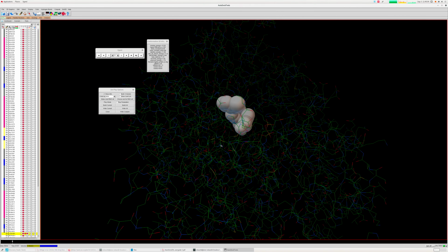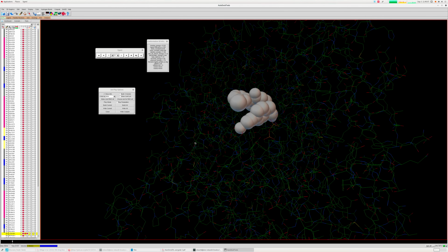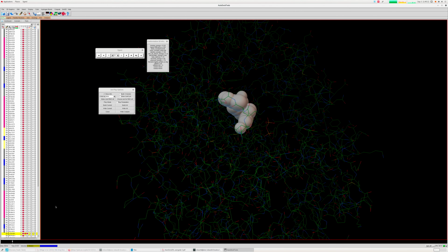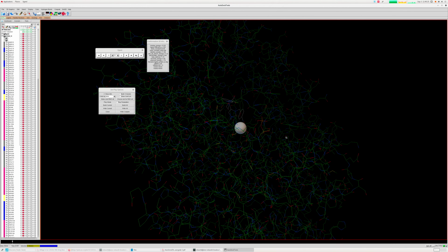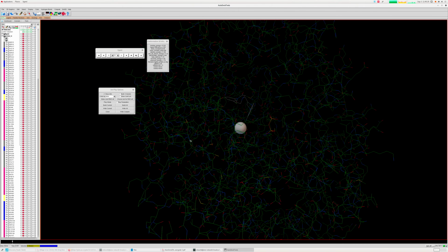Okay, so this is how you can prepare the docking parameters for zinc as a pseudo atom, and then by utilizing the zinc metalloproteins, you can dock small molecules into it so that you can see the interactions. Now you can see the zinc atom because I have switched off the spear model for the ligand, and you can see the zinc atom over here.